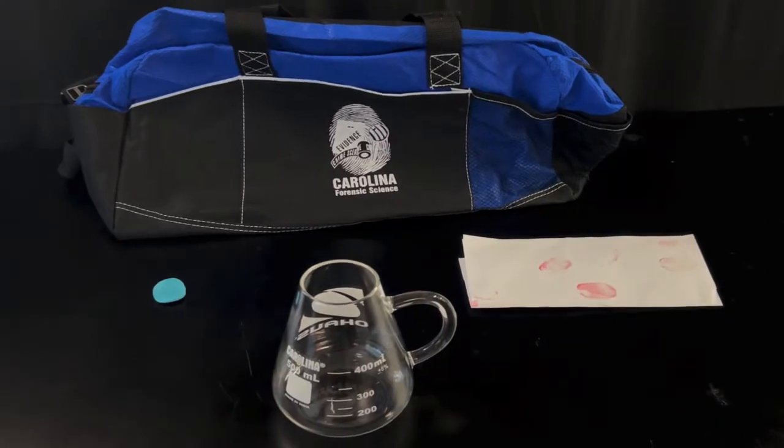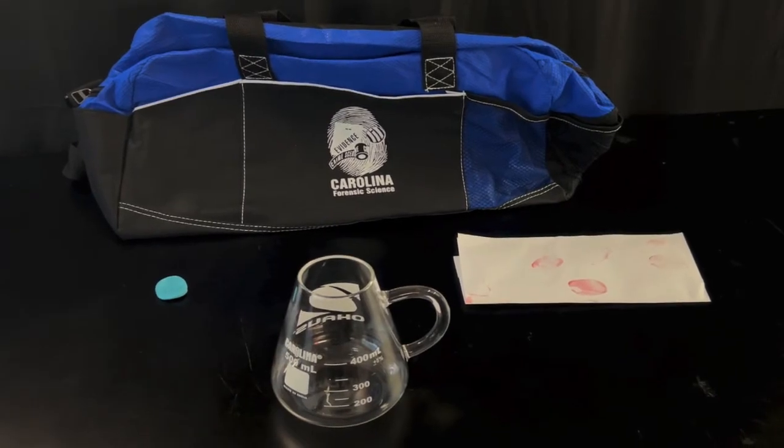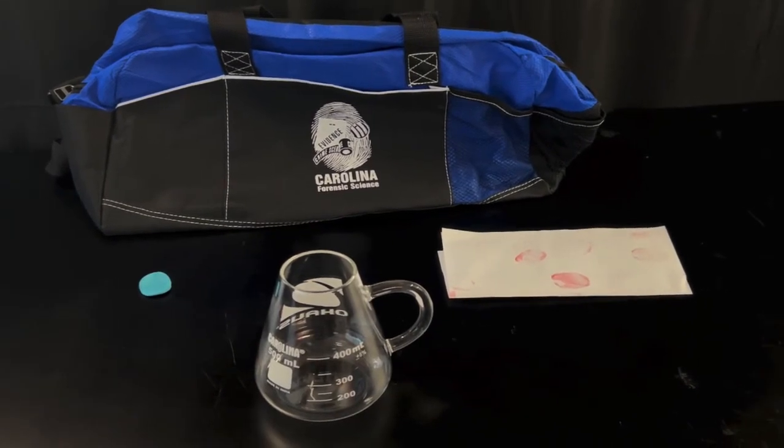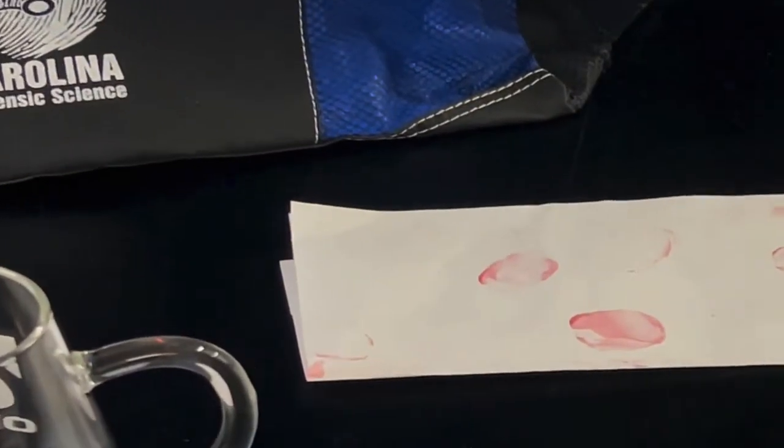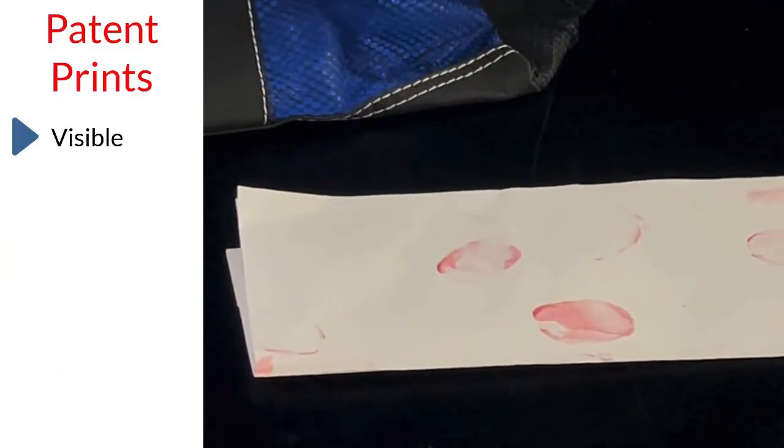There are three major types of fingerprints. Each type is identified by its visibility and the material the print is made in. We will first look at patent prints. Patent prints are visible prints formed in a material such as ink, paint, or blood as shown in this example.